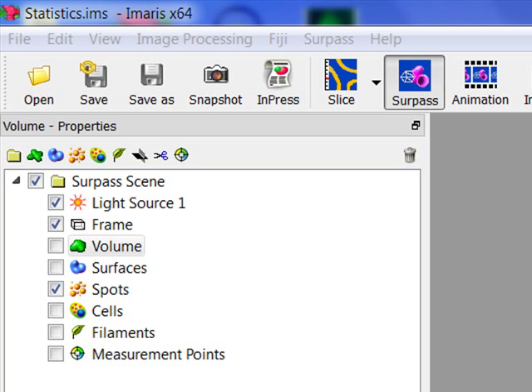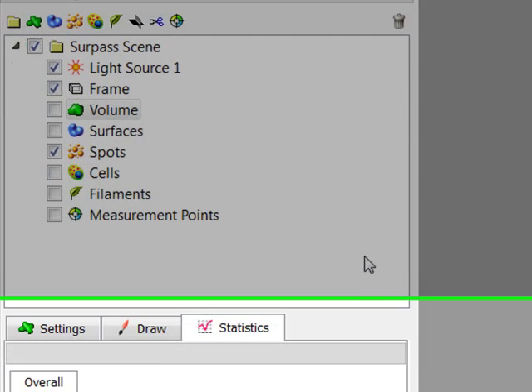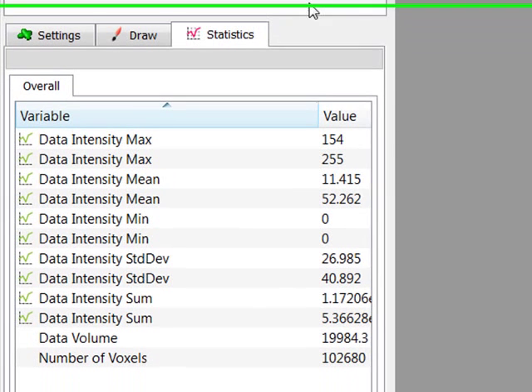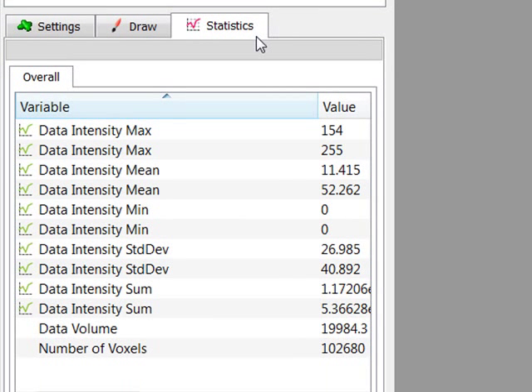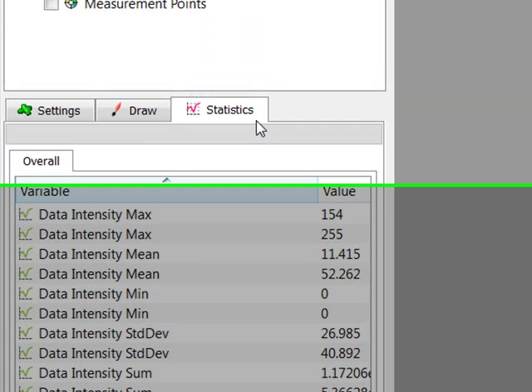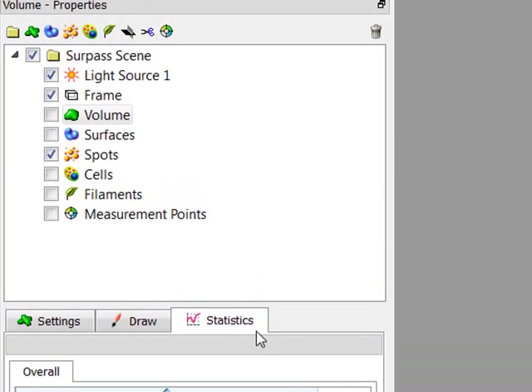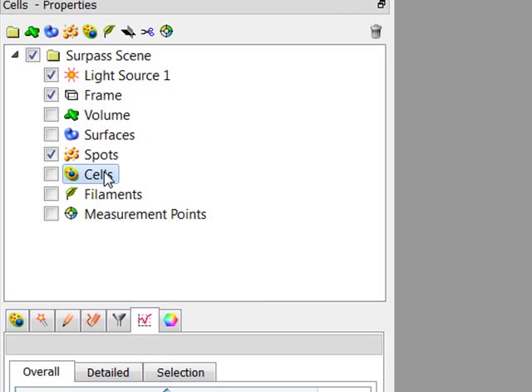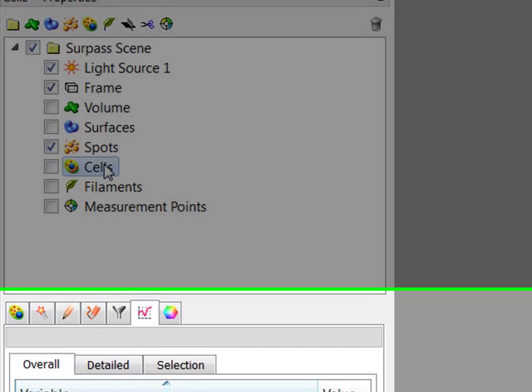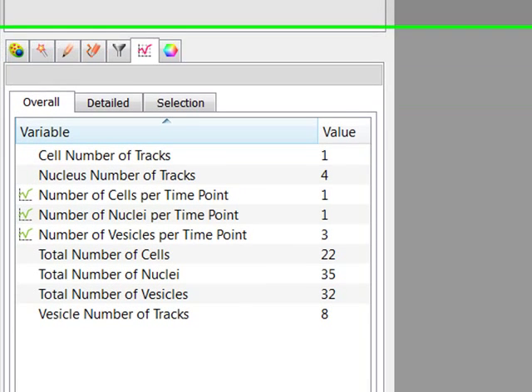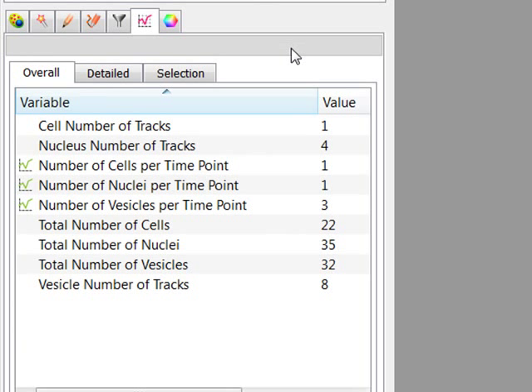Once an object is created, all its statistical values can be found under the Statistics tab. Click on the Object of Interest in the Surpass list, and in the Object Properties area, click on the Statistics tab.